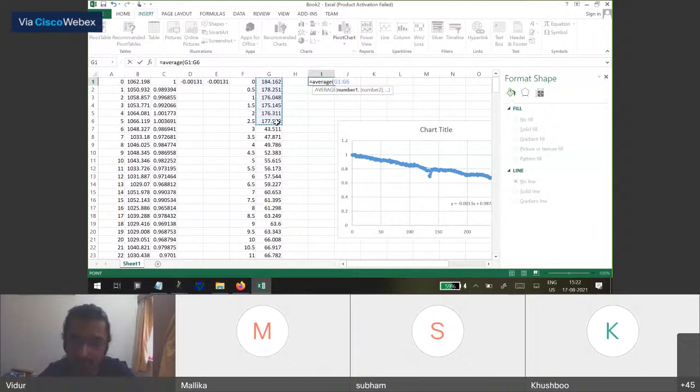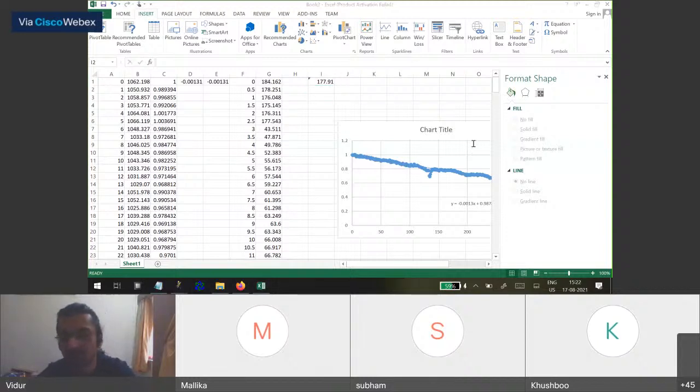There's a question: if we see for the recovery, it is not coming back even 50%. Why is it so? There could be multiple reasons. The first one is that there is some bound fraction. So not all fluorescence recovers in the region of interest. And it's, let's say, bound to some particular component, let's say a vesicle, or a membraneless organelle. Let's say if you're bleaching within the nucleus, is there a bad or rapid recovery from the cytosol. Those are common reasons why we may not see complete recovery.